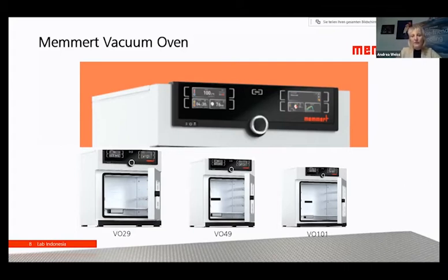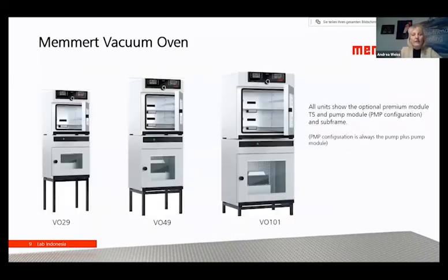in the interior. You can see here on the screen also the panel, which is a controller of generation 2012. And you can also see here most important setting, of course, when we talk about vacuum oven, that is temperature, and that is a pressure setting on the vacuum oven. Here we can see complete set.